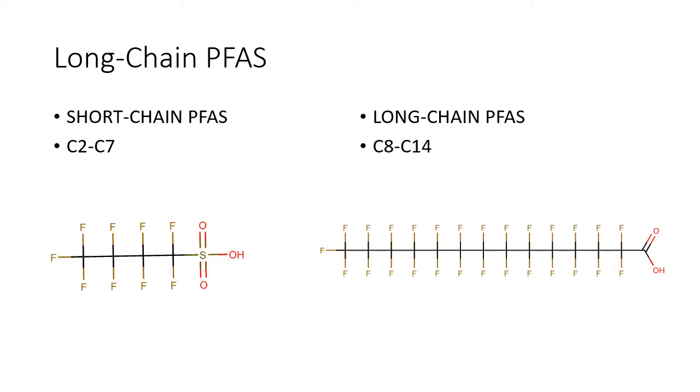and we have an example down here of a C4 sulfonate. And for long chain PFAS, we're going to be considering 8 carbons to 14 carbons. And so the 8 carbon PFAS includes PFOS and PFOA, which are essentially globally regulated.